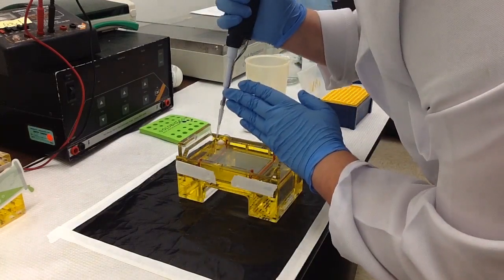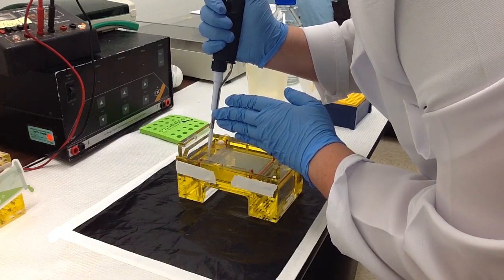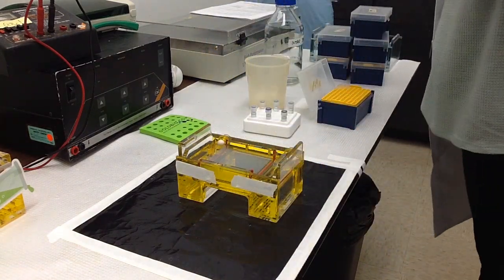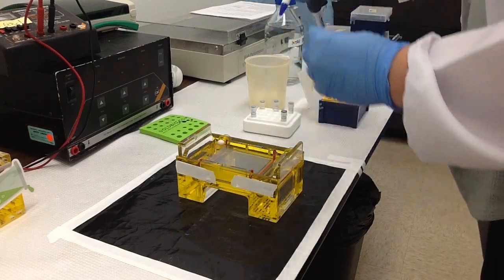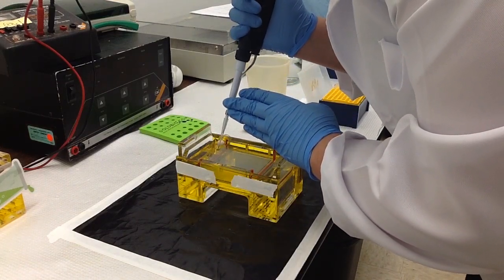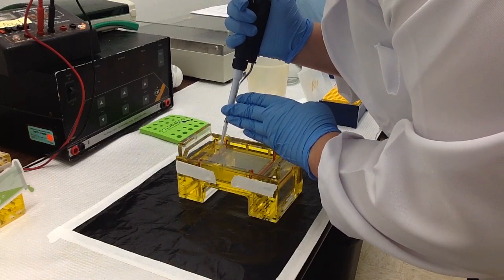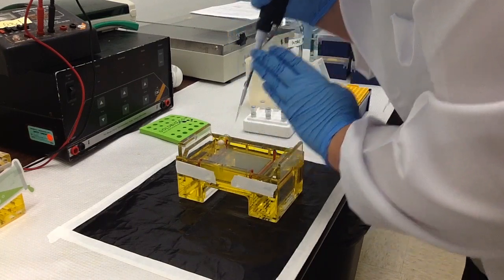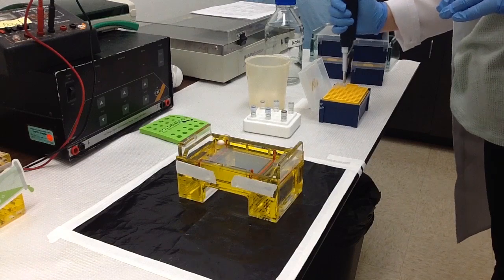Using the same technique but in a separate gel, I will be loading a 1KB, a 1KB plus, and our Versa ladder. Our Versa ladder is unique in that it has bands of varying sizes all the way from 100 base pairs up to 10,000 base pairs.